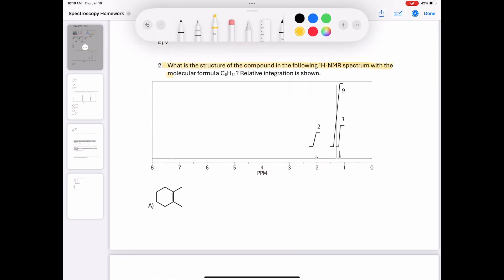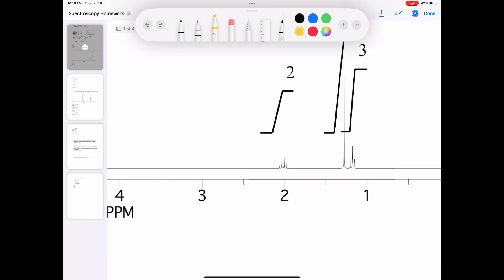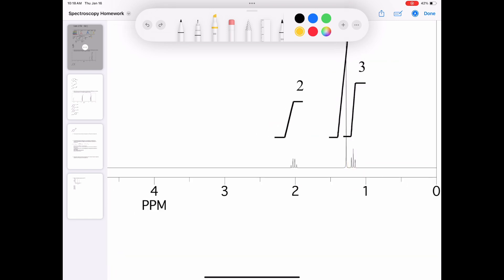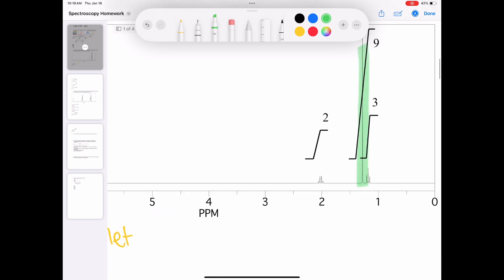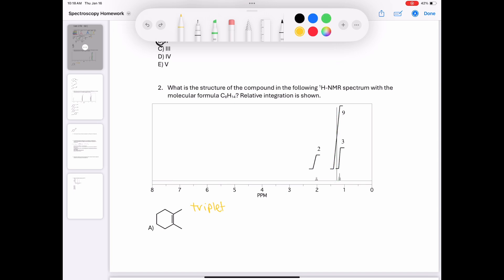Question 2 asks: what is the structure of the compound in the following proton NMR spectrum with a molecular formula C8H14 with the following integrations? Zooming in, the first peak on the far right looks like a triplet in yellow, the second peak looks like a singlet in green, and the last peak is a quartet shown in blue.